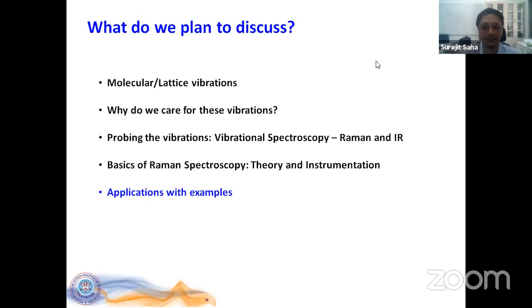Okay, so what we are going to discuss today is basically, you can see a flow chart, where I'll be touching upon what we have studied in schools or even in college days about molecular or lattice vibrations. And then why do we care about these vibrations? That's the question I'm going to ask. And then how do we probe these vibrations? Because if we have an answer why we care, then we can ask how do we probe and then how we go ahead. And for that, we'll require some knowledge about instrumentation and some basic theoretical ideas. And once we summarize all those, then I think we'll be ready to go ahead with some of the applications that we have in mind.